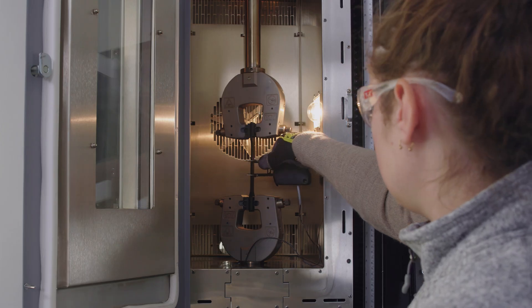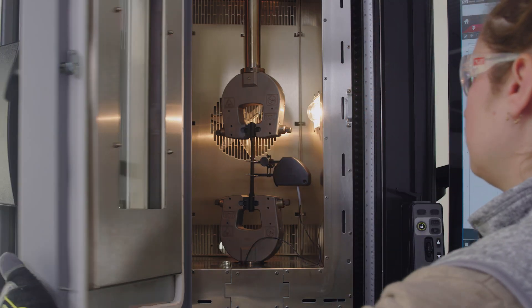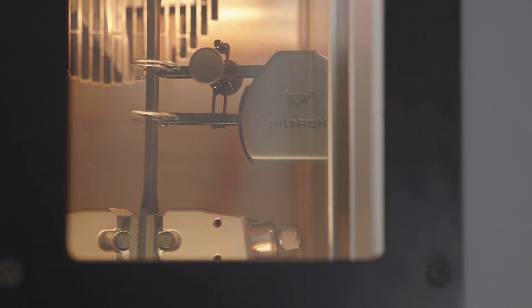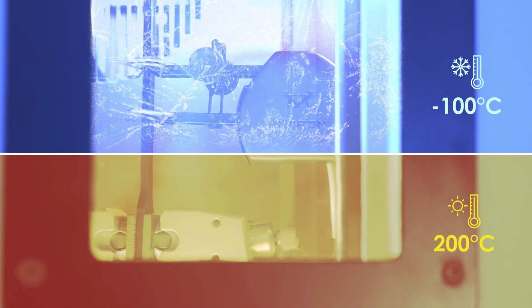This extensometer can be used at both ambient and non-ambient temperatures, allowing you to measure strain in environmental chambers with acceptable temperatures ranging from negative 100 to positive 200 degrees Celsius.